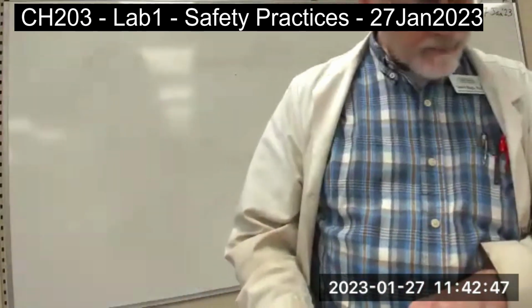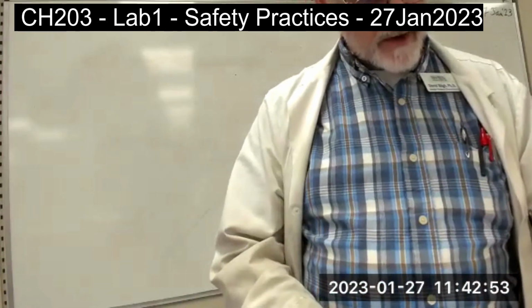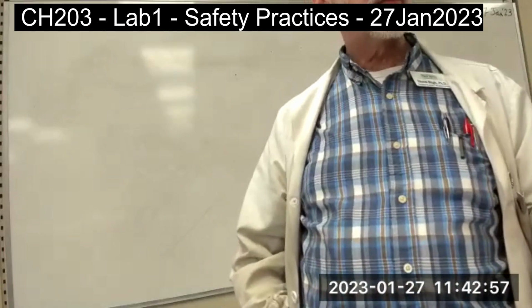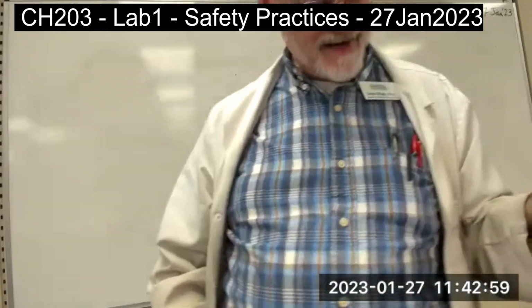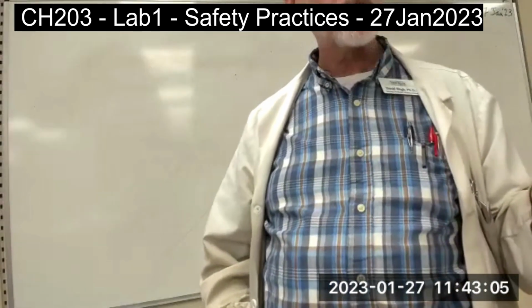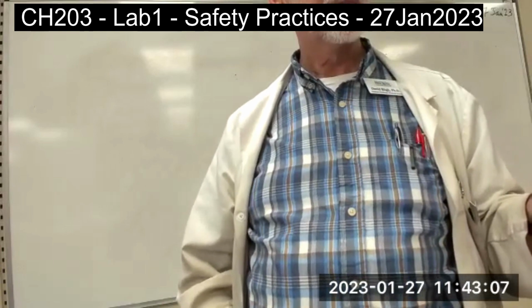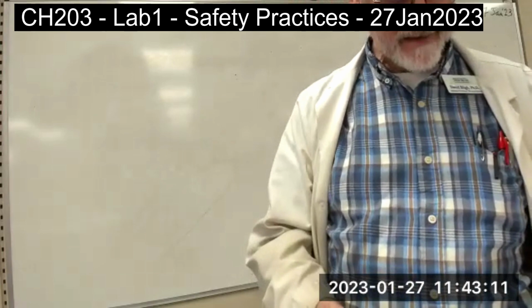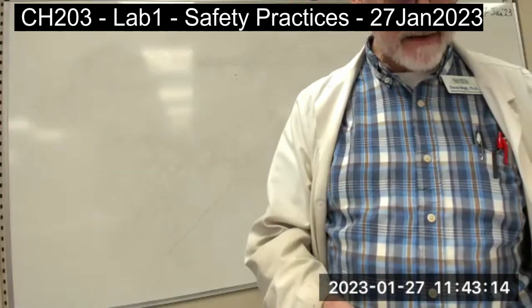So you got a lab quiz here. The interesting part is that last one, where they talk about Sarah walked into a laboratory and did this and did that. You're looking for things that she did wrong. And I've got a list of 9 of them. That's why there's 9 points there. All right, so see if you can find 9 of them.